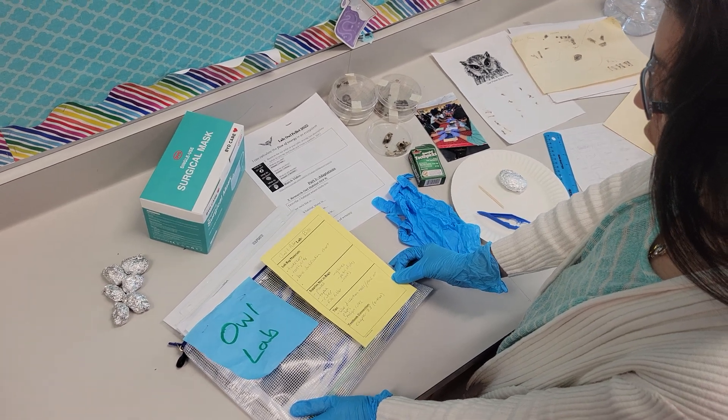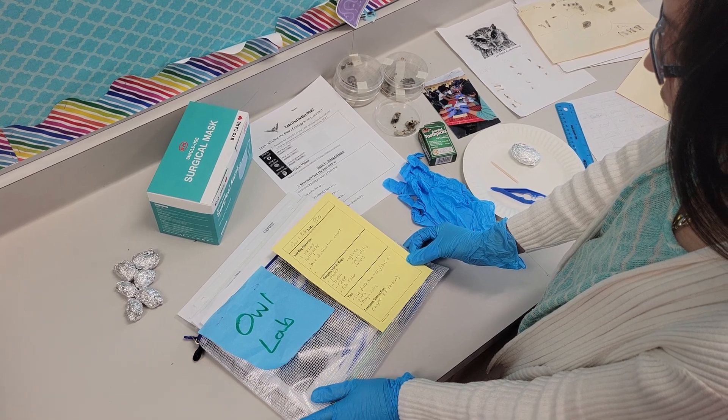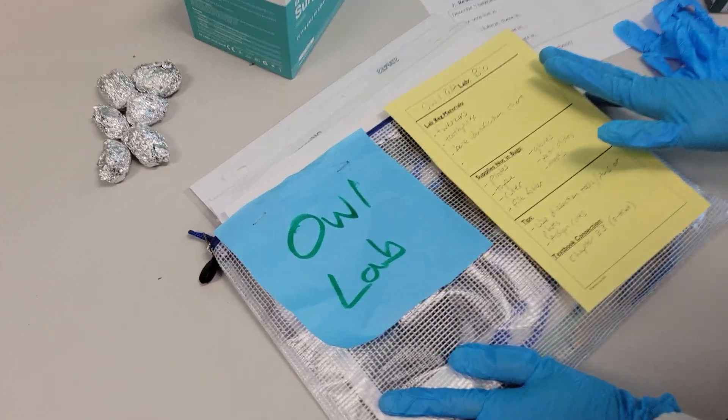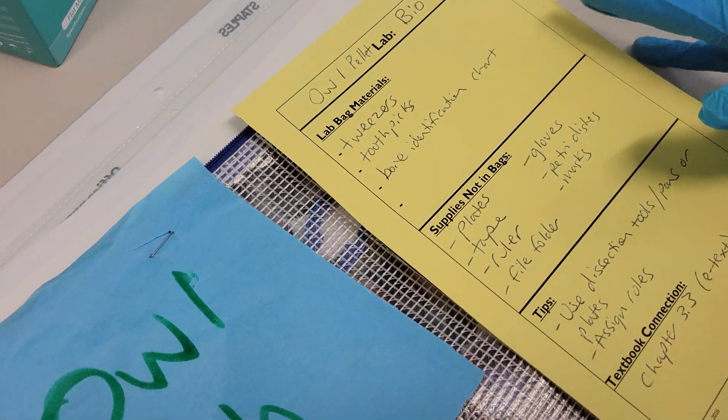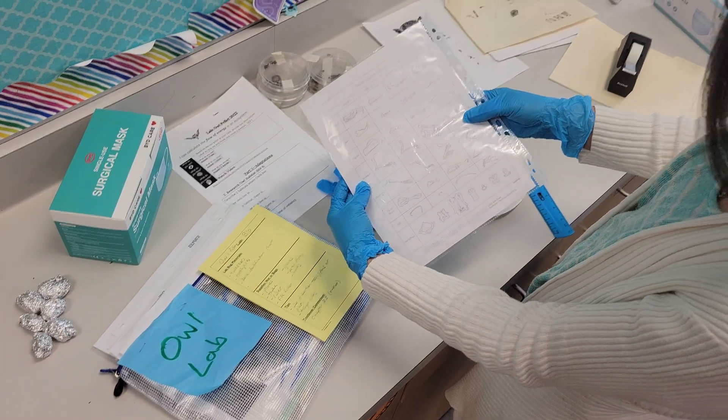This is Mrs. Idio with Ms. Morris O'Hearn here at Lawndale High School, walking you through our lab bag for the Owl Pellet Lab. Inside the bag, ideally you have some tweezers, some toothpicks, and a bone identification chart ready to go for each of your groups.